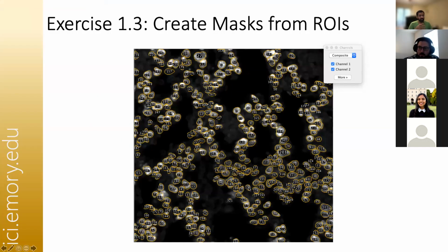Again, the goal for us is to utilize the segmented masks that we get today and semi-automate this process by using this in CellProfiler, okay? And that's why we need this automated mask. For example, we will try to see if we use the same image in CellProfiler, how good of a segmentation it can do, right? But if you want to use one of the deep learning models on CellProfiler, which you cannot at the moment, this is one way of doing this, which is you generate a mask outside and you can import that mask into CellProfiler.